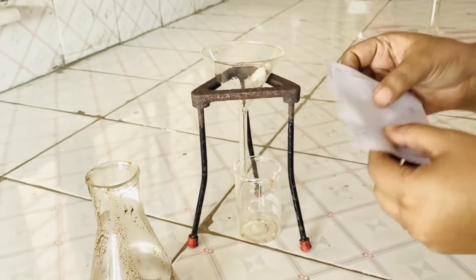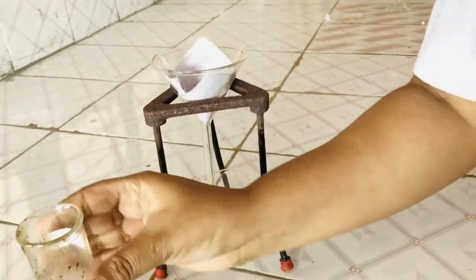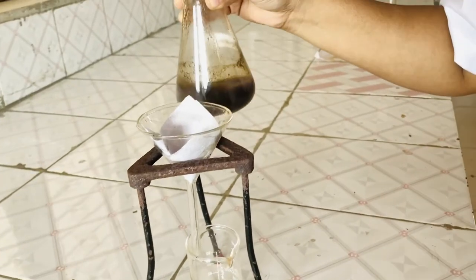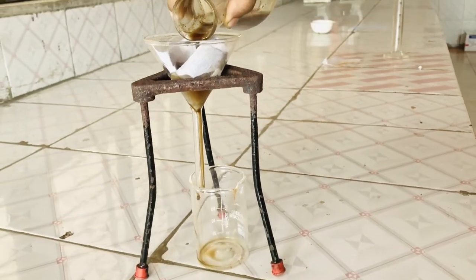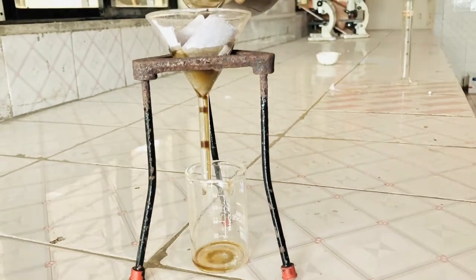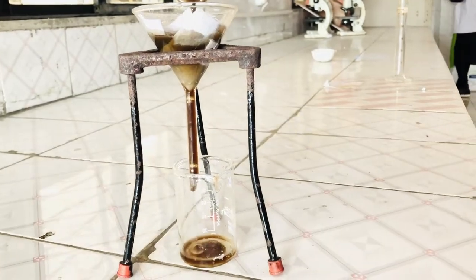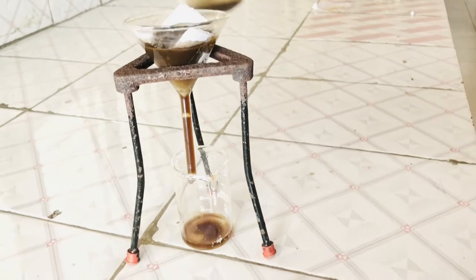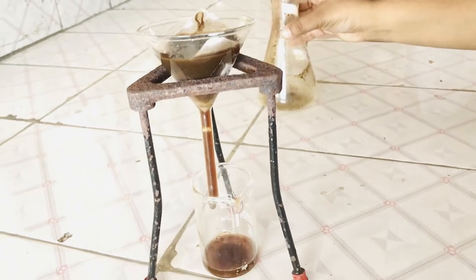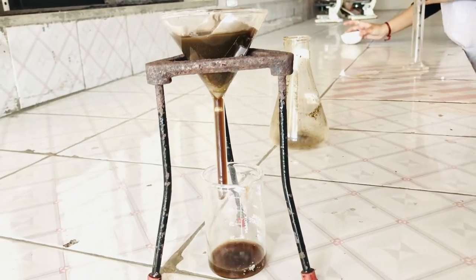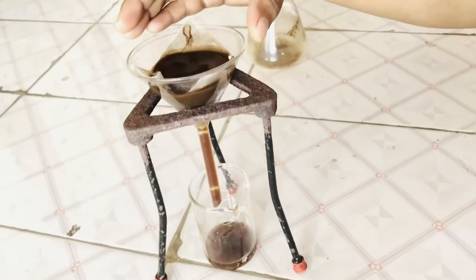Slowly we have added the funnel. Now we are adding filter paper on the funnel like this and we would pour the contents of the conical flask through the filter paper. Add slowly. You can see the contents are pouring down. We would collect the extract and discard the residue. It will take a little time.